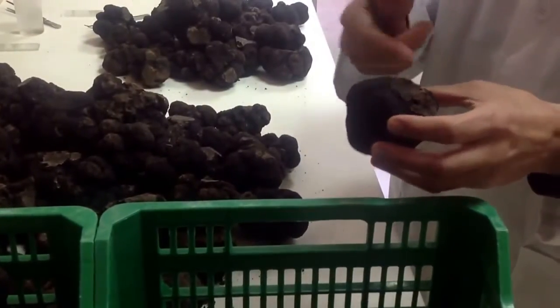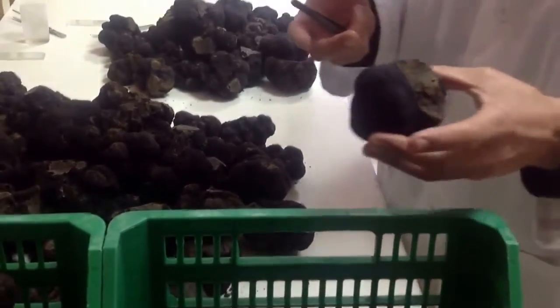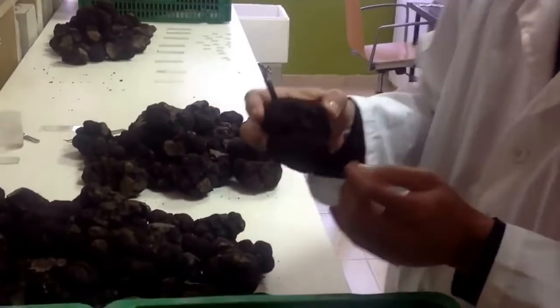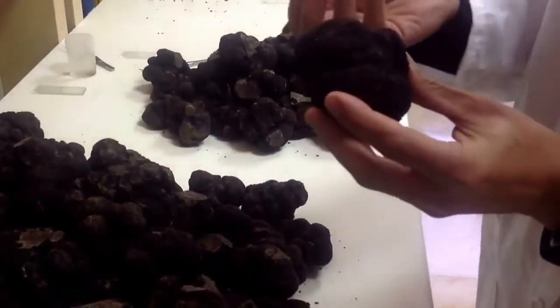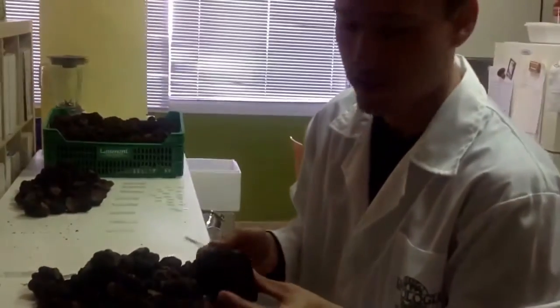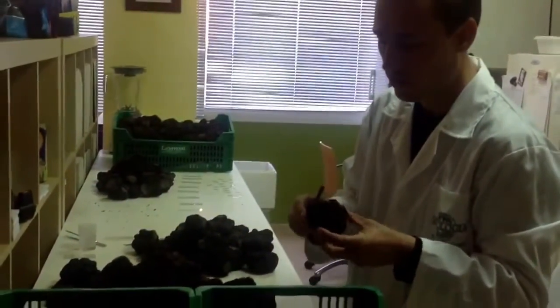We also check the level of maturity. This one is quite mature for mid-January. For example, this truffle has a few holes from beetles, so we are not using it for inoculum because it can host contaminants and other pests, and it is really hard to disinfect.